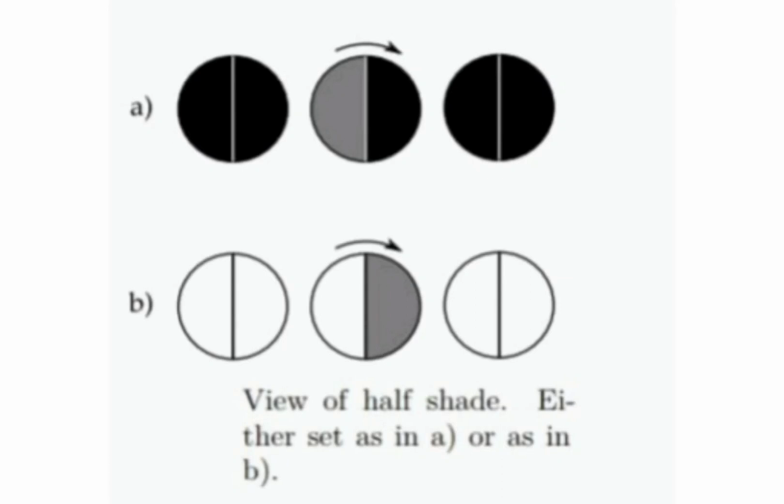Here we see two halves of unequal intensity. This is not what we actually want to observe. We want to see the two halves of the field with intensity equally bright or equally dark. We can see here both the halves are changing from equal to unequal intensities.